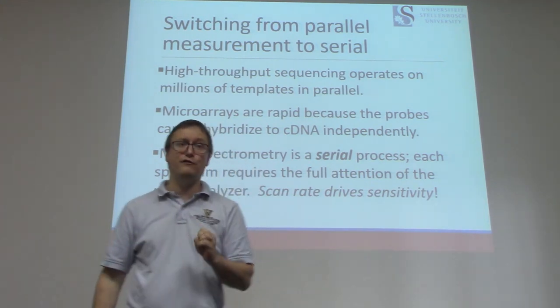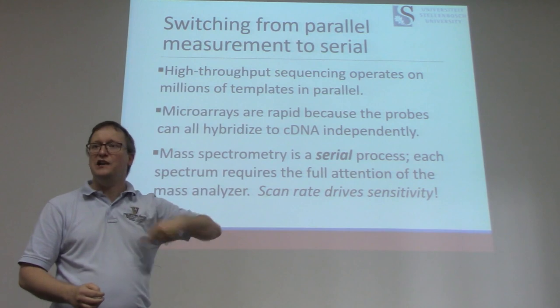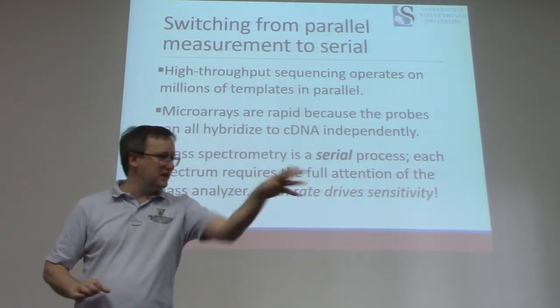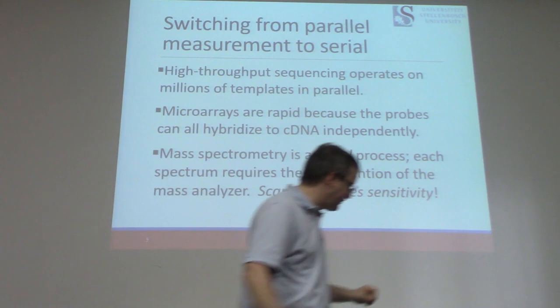And that gives us the need for chromatography, or separation. So this process, then, is going to have a high-throughput serial process, where the instrument takes a snapshot of this, and then that, and then this other, kind of like an Instagrammer on steroids. Okay, so let us go ahead and move ahead.